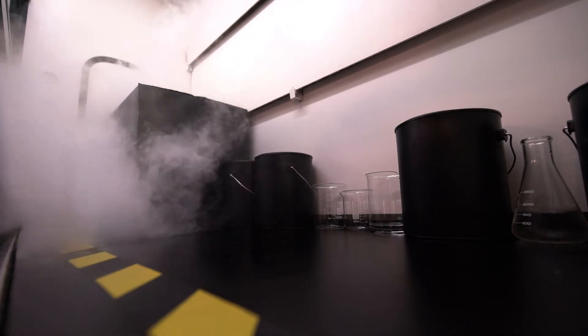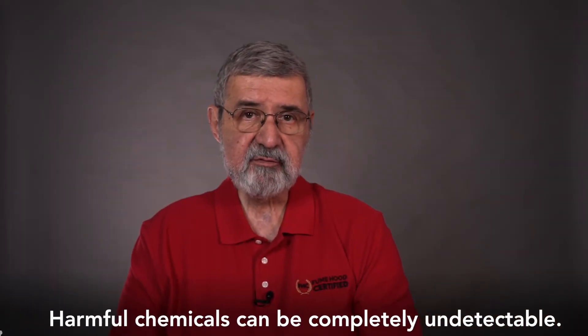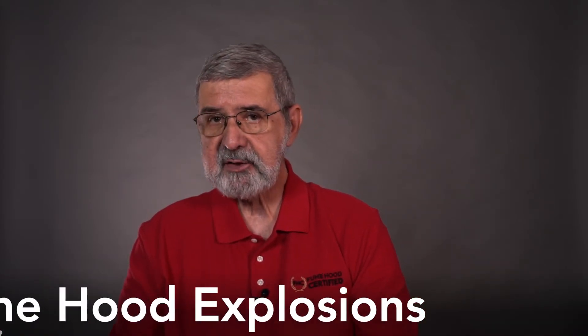Back to your breathing zone: given the complexity of laboratory ventilation and room conditions, it's nearly impossible for any hood to contain one hundred percent of the time. We can almost guarantee some loss of containment. In demonstration videos we use smoke or theatrical fog to help visualize airflow and show loss of containment, but in real life the fugitive chemicals are likely to be invisible and maybe even odorless. Whether or not you inhale those fugitive chemicals is greatly influenced by the position of the sash in relationship to your breathing zone.